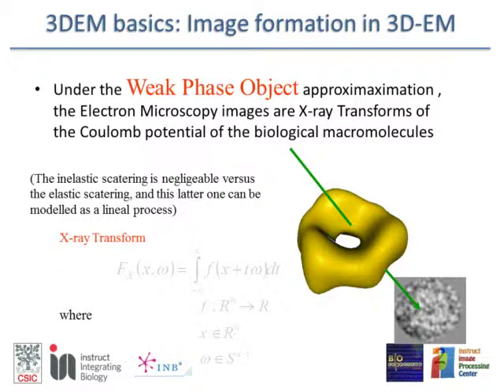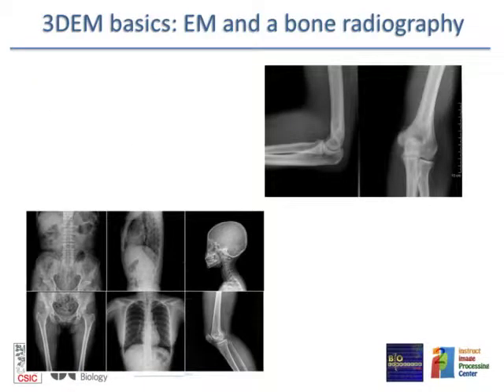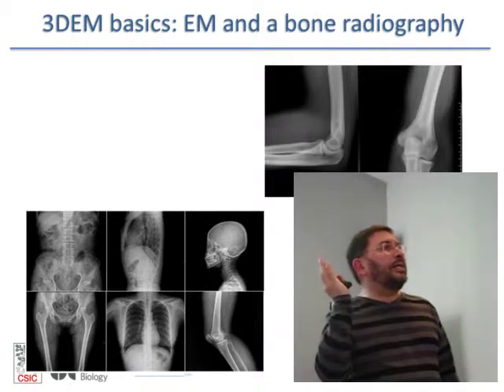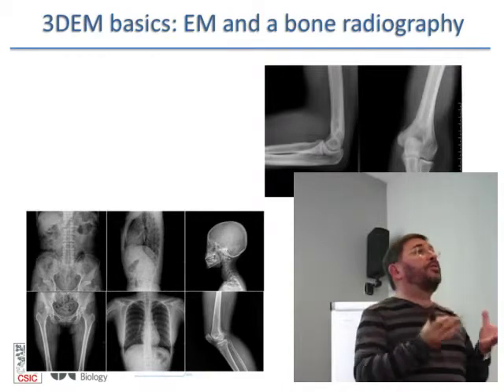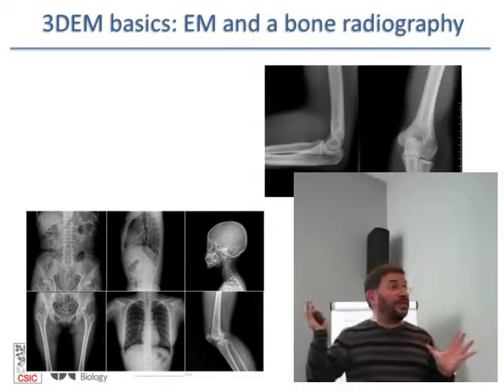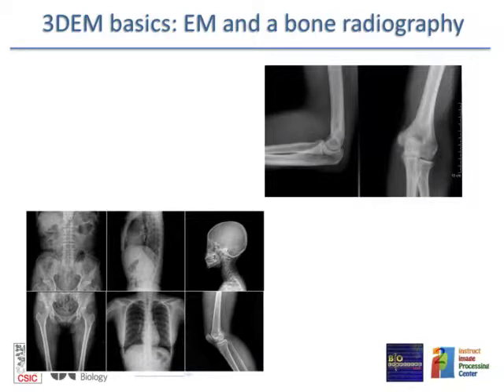Exactly the same as what you see in medical imaging. The mathematics and the physics are completely different, of how CT works and how X-rays interact with matter and things like that. But at the end of the day, the beauty is that you get that. And of course, that means that the two fields, medical imaging and electron microscopy, can work together, trying to solve these equations and go to the 3D structure. And we have done it. For more than 8 years, we have had an NIH project with the biomedical people, because it's exactly the same issue.